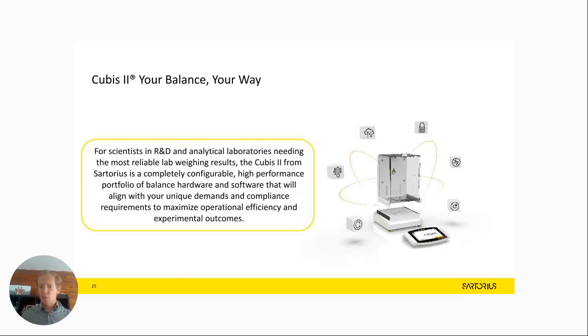But now it could be that you work with something hazardous, like cancer-related materials, or anything which is not very healthy. Then I would not put my head into a cabin or an isolator to level my balance. The instrument which you see in front of you has automatic leveling. So you press a button and it does it itself, because of safety. That is my last comment. I don't see a lot of questions. That's good. I hope it wasn't too boring and I answered all questions. Maybe, I hope.